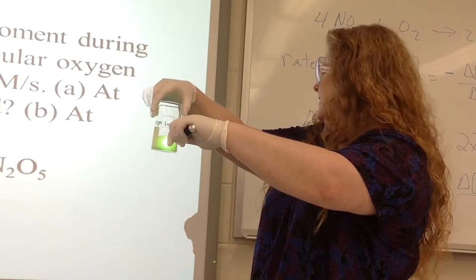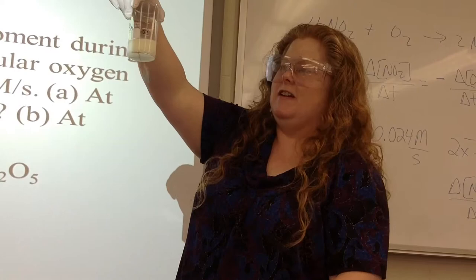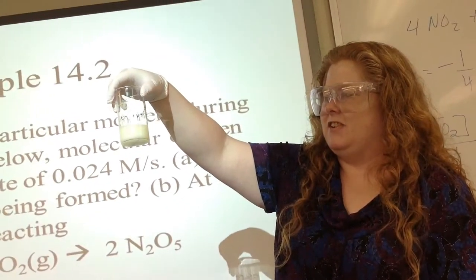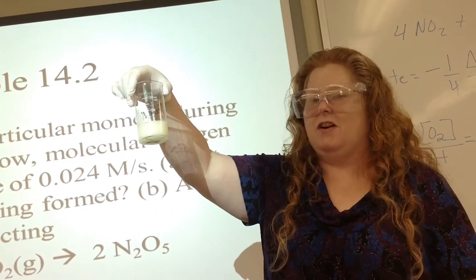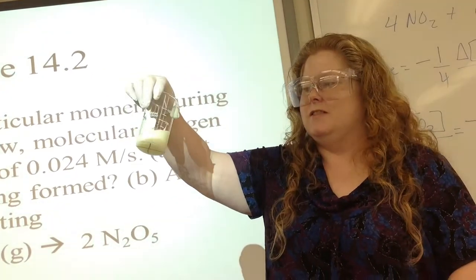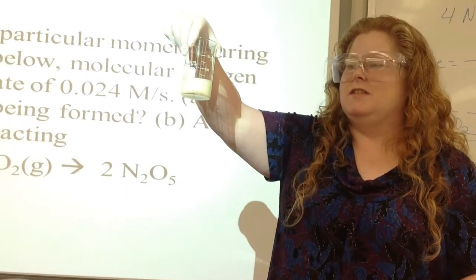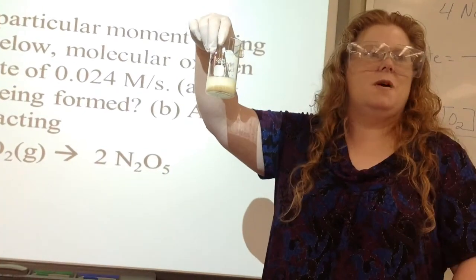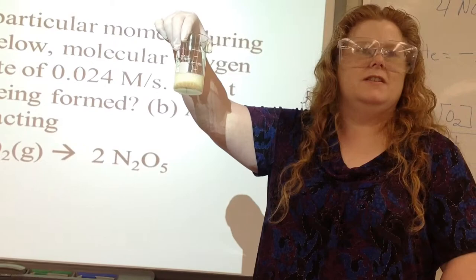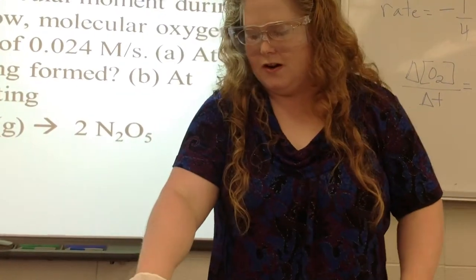Let's see any light getting through. Now what we're seeing, the yellowish stuff in here is sulfur. Solid yellow sulfur. And it's a suspension. If I let this sit long enough, the sulfur will settle to the bottom. And I could filter it. I could filter it and I could remove the sulfur if I want. Okay, that was full strength.